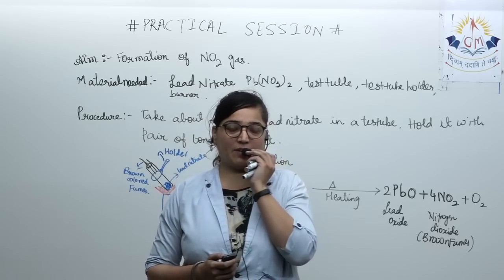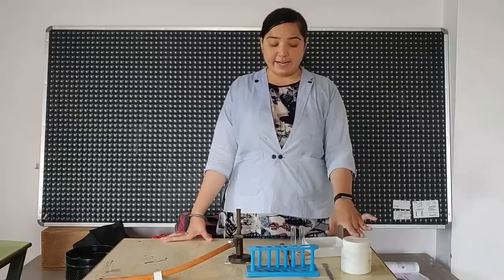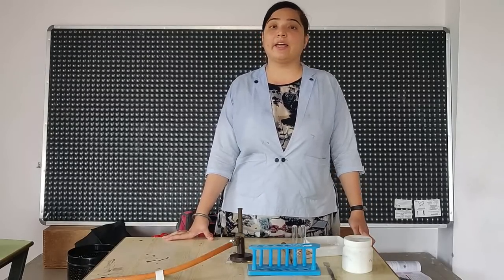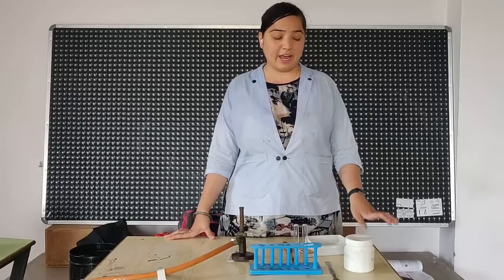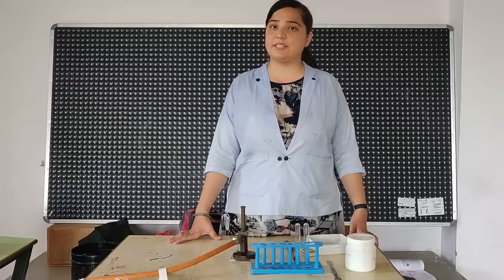Now, let us have a look at the experiment of this. In this session, we are going to see how when lead nitrate is heated, we get nitrogen dioxide gas. You will study this even in your class 10, and further if you opt for science stream, again you will study that nitrogen dioxide is formed when lead nitrate is heated.